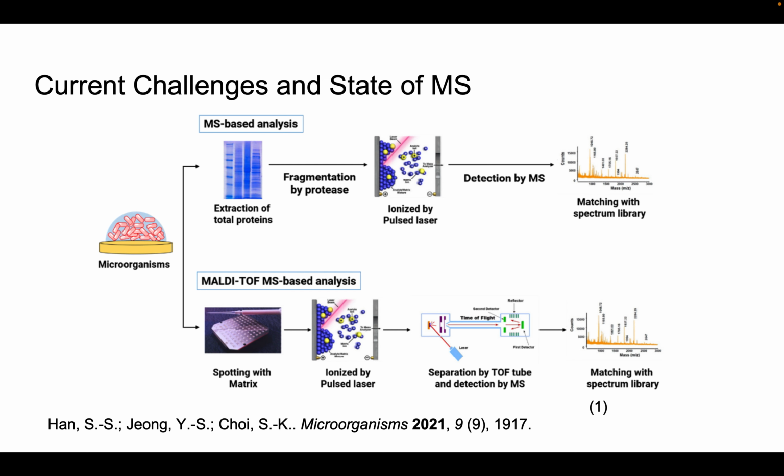So what they've done here is, through being able to spot the protein extract directly onto the matrix and then using MALDI-TOF, you can have this process done in one step instead of having to run an SDS-PAGE. So the same spectra can be obtained in fewer steps.